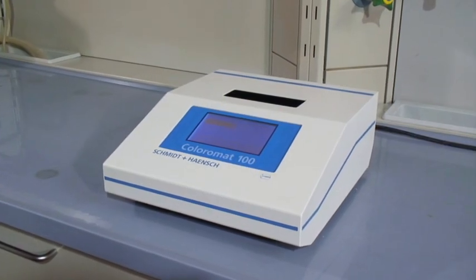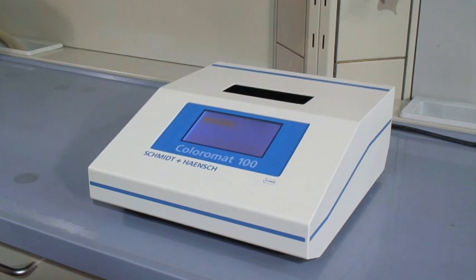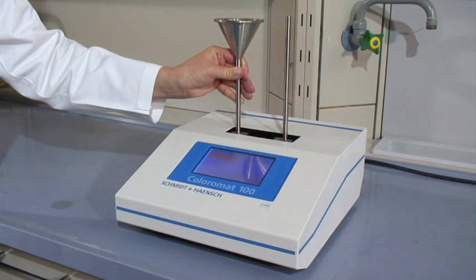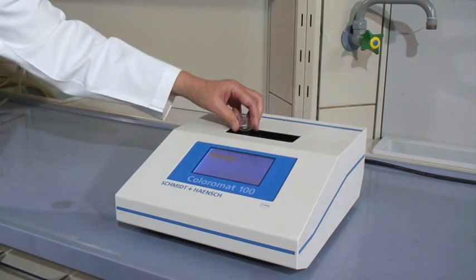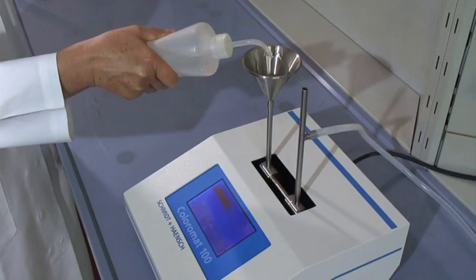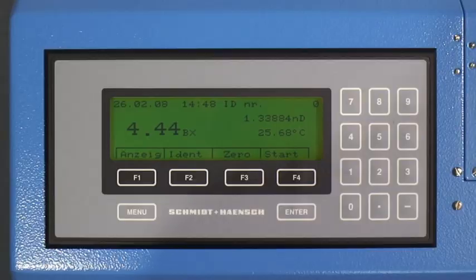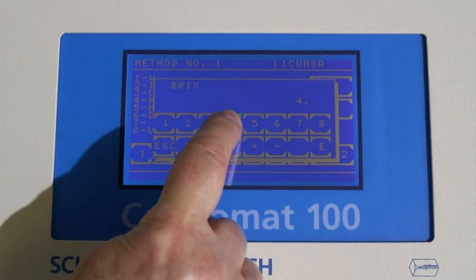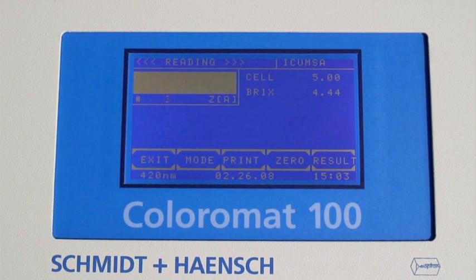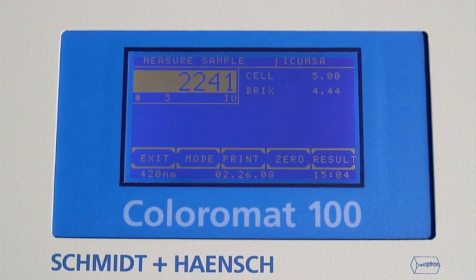The newly developed ColourMap 100 has been developed for routine measurements of colour of liquids. This instrument is also designed to facilitate your daily work. You can use flow-through tubes having a length of 100 mm as well as single cuvettes with a length of 10 and 50 mm. The system is easily set to zero by using distilled water in the respective measuring tube. When applying the ICUMSA method for the determination of liquid sugar colour, the Brix value is taken preferably from one of the wide selection of Schmitt & Hensch refractometers and entered via the touchscreen. By activating the simple start button, the ColourMap immediately measures the ICUMSA colour and issues the results in ICUMSA units.